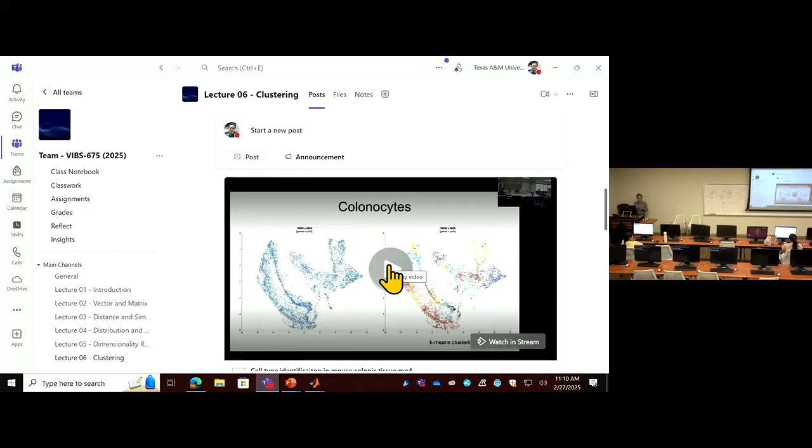He basically illustrated the steps after clustering and the annotation of cells. He worked in the nutrition department, so his sample is from the colonic cells from a mouse intestine. So I'm going to play and see how it goes.